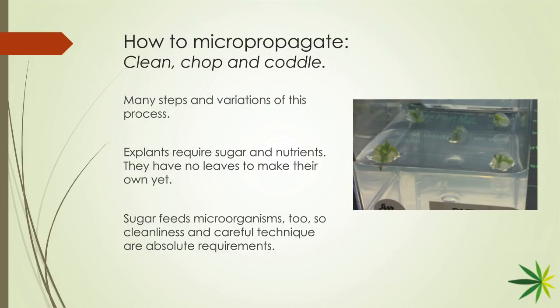But then there's all the other additives, sugar, the antimicrobials that you have to add. Sometimes some methods use plant growth regulators, those sorts of things. That's where the mixing comes. Generally, the standard salt mixtures, there are so many different varieties of them. There's not much invention there, although in a large-scale operation, there is tweaking. Certain minor constituents you might want to tweak to optimize the process. But that's something that happens as you go along and as you scale. The generic formulas, those are well known and can be found by anyone with some Google skills.